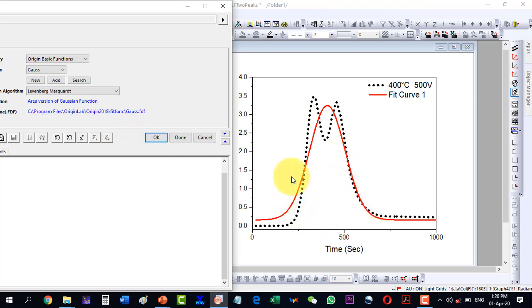If the fit is required only to fit the data and not the two peaks of it, then it is good that I select this one. But if my desire is to fit both the peaks of it, then this one is not acceptable.